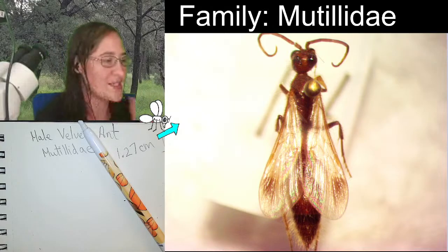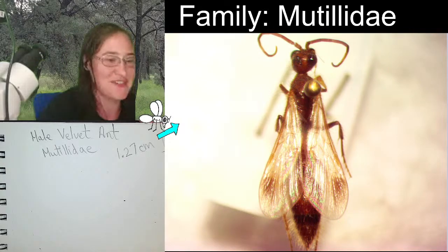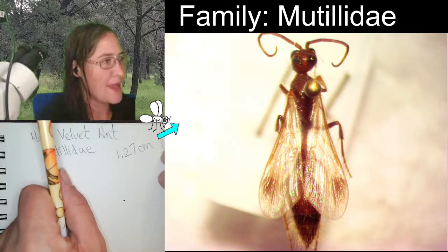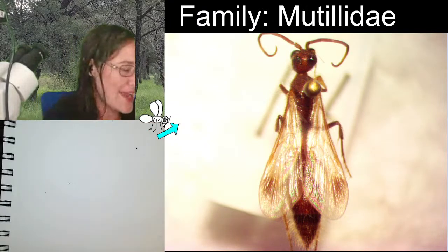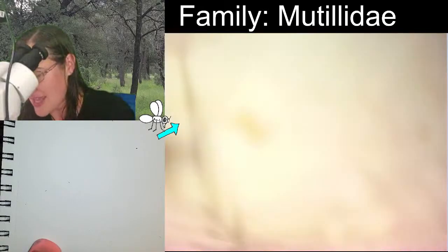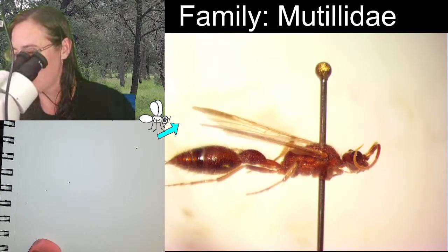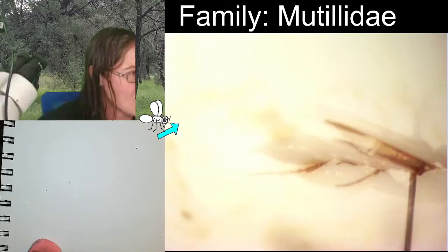And I guess my question to you is close enough to half an inch. Yeah, exactly. My question to you is, do we want to draw it from the top or the side? There's a part of me that wants to draw it from a lateral point of view, because if we look at it from a lateral side, we only have to draw one set of legs, and we can see the cool shaping on the abdomen, and you can't see that shaping on the abdomen from the dorsal point of view. Plus, it looks like we'll be able to get a little closer. That's so cool.